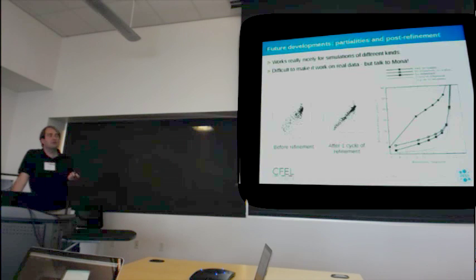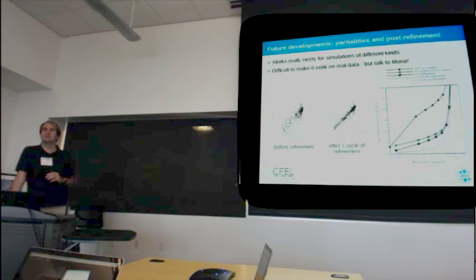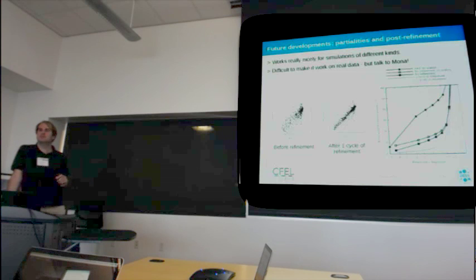It turns out Mona, who I thought was going to be here but actually isn't, who works on the cctbx side of things, has successfully made this work for real data. So that's absolutely fantastic, because that means that it's possible. So hopefully very soon you'll be seeing this generally applicable for every data set, and that should give us a boost in the quality of data we get.